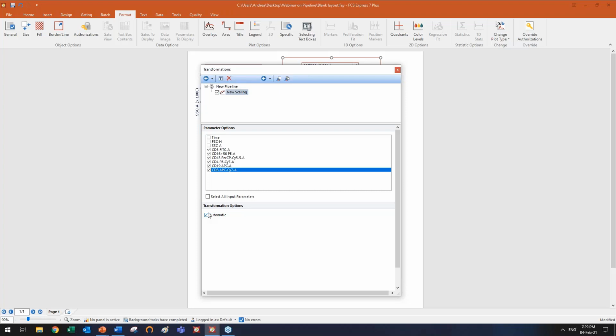By default, unless you change them, in this case, I'm dealing with a pretty standard FCS 3.0 file. By default, the instrument-specific setting for this type of data are to scale fluorescences with biexponential, and scatter parameters and time with linear scale. So if I select all, it means that they will all be scaled, but time and the forward and side scatter with linear scale, and fluorescences with biexponential.